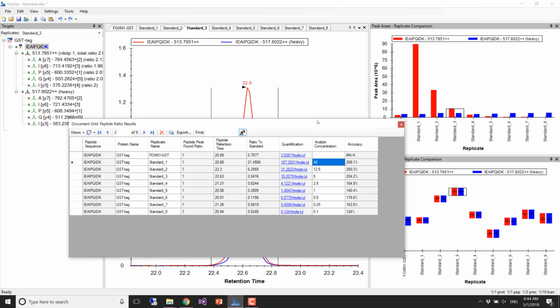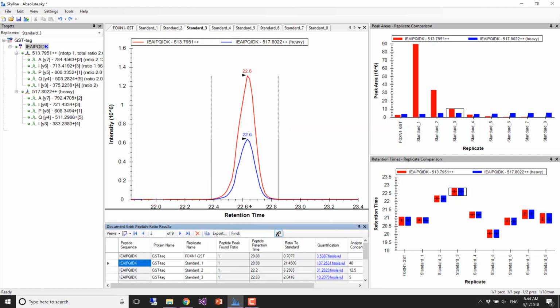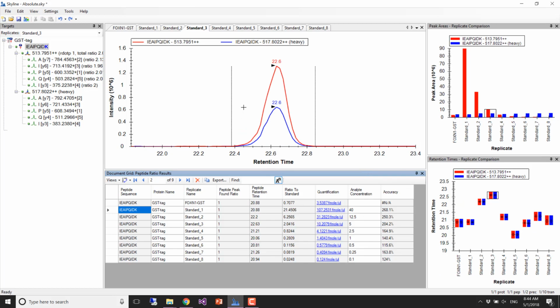But there are some things once we start using a calibration curve that we're going to look at. So is everybody here? I guess there are now more and more people who are not actually following along. Okay, so we have our estimate of 3.5, but probably we're getting a little bit dubious about it, and you can get a sense for why we should be dubious by looking at the curves. I just docked my grid at the bottom so that I can show you the curves as well.